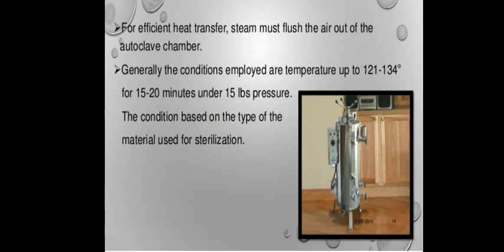When the temperature rises to 121 degrees Celsius at 15 lbs pressure and it is held for 15 minutes, all the types of microorganisms, even the spores present inside those materials, be it medias or reagents, get completely killed, and these media get 100% sterilized.